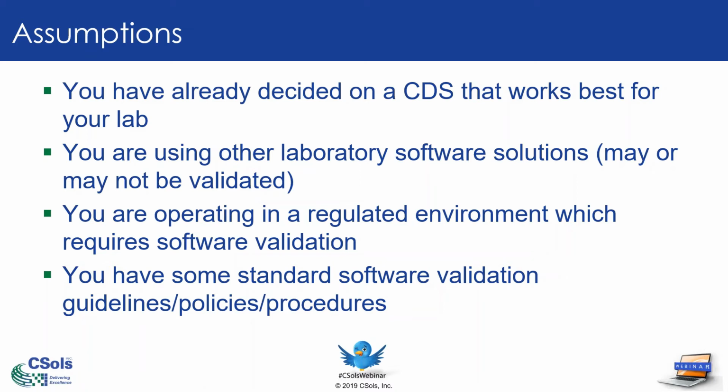Also, the assumption that you have other laboratory software solutions that you're using in your lab, and they may or may not be validated, but most chromatography systems, and I'll touch on it a little bit in terms of things to consider, can and do interface with other systems, but really the focus of this is mainly on the chromatography aspect of your program.